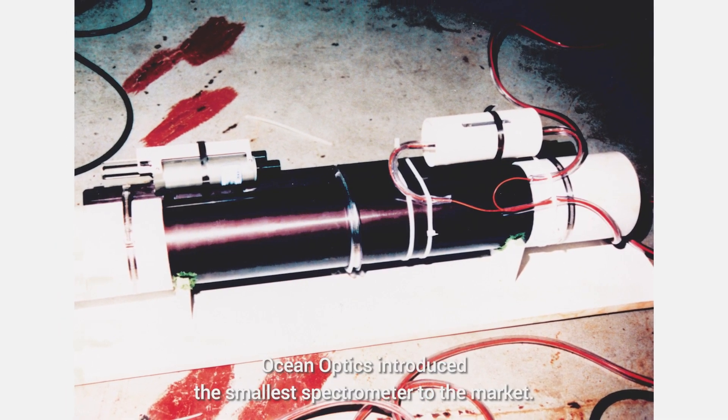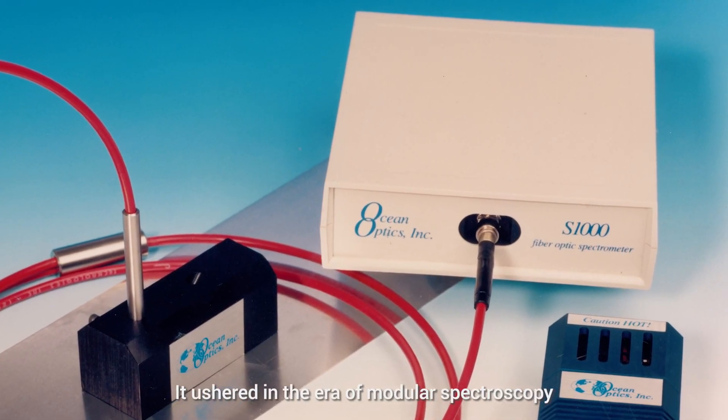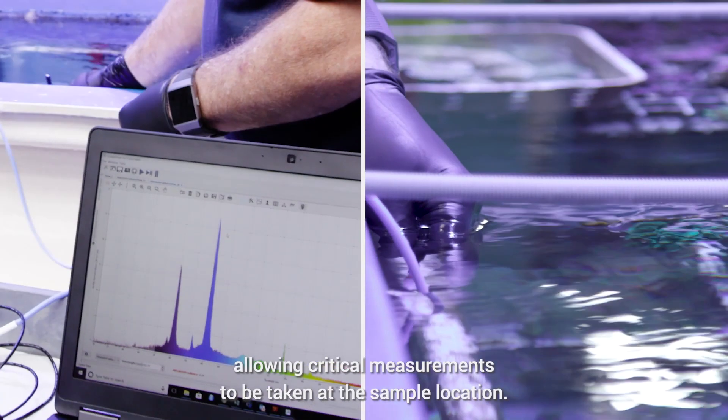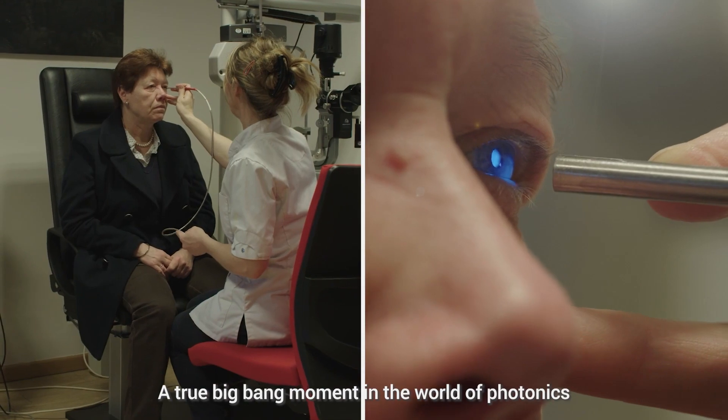Over 30 years ago, OceanOptics introduced the smallest spectrometer to the market. It ushered in the era of modular spectroscopy, allowing critical measurements to be taken at the sample location — a true Big Bang moment in the world of photonics.